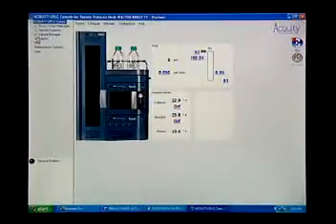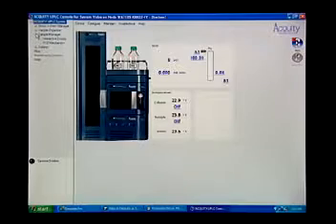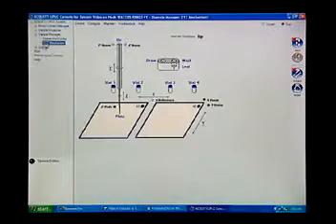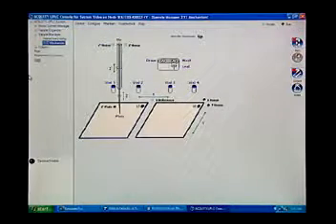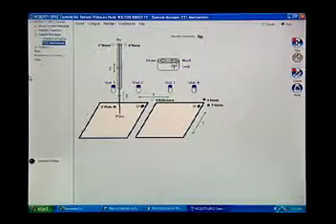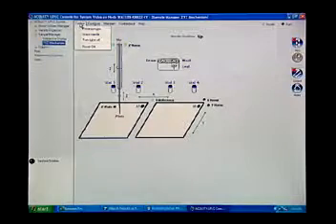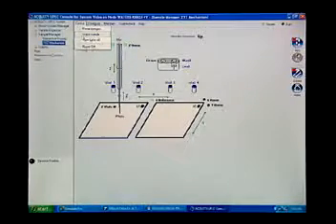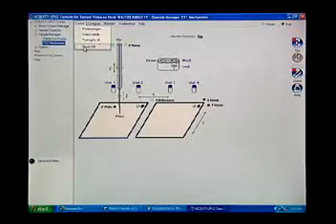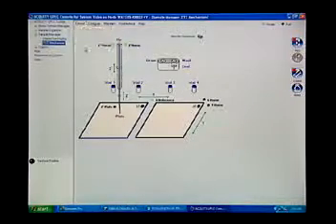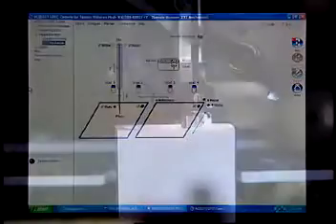In the Acuity console, select Sample Manager, XYZ Mechanism from the system tree. From the control menu, select Reset SM to bring the XYZ mechanism to its home position with puncture needle above the wash station.